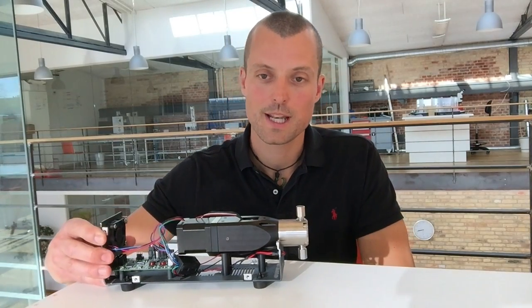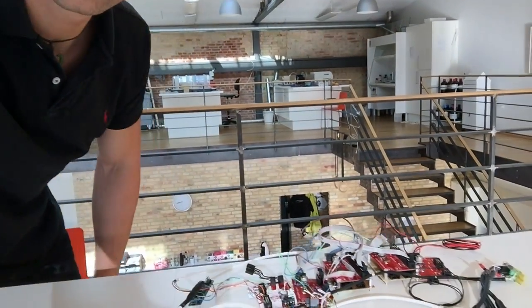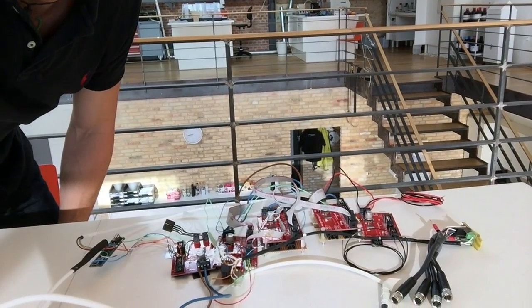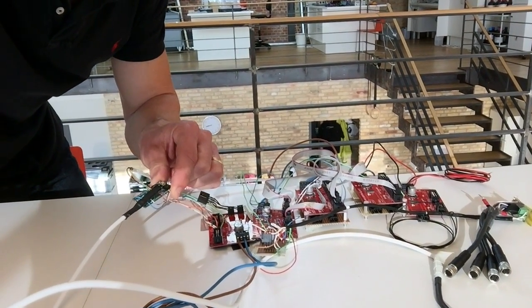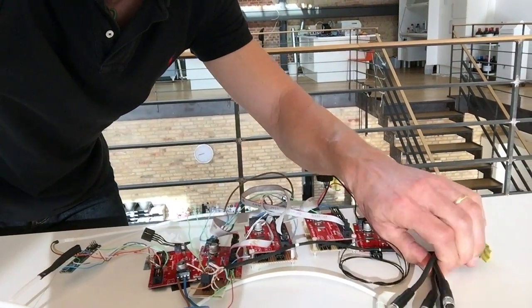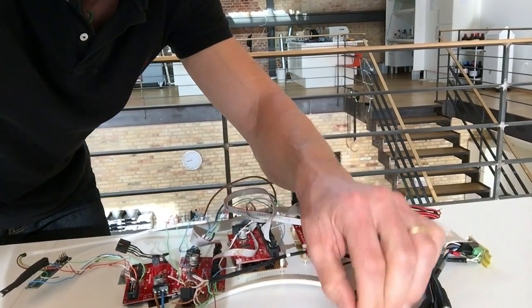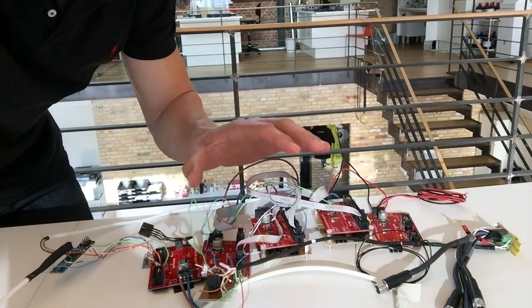So in the meantime, Lasse has made this very crude and quick-and-dirty markup of our pump electronics. It's basically just an Arduino that can run a simple flow control. We have the stepper drivers, and we're able to connect the low-pressure flow sensors and the high-pressure flow sensor. It's by no means pretty or stable, but it's actually good enough for us to build our first lab prototype.